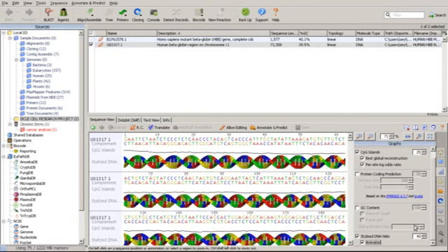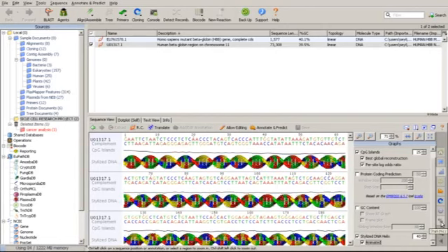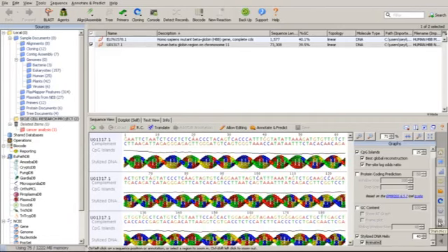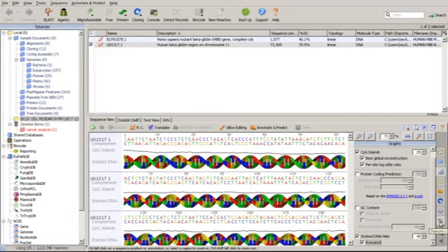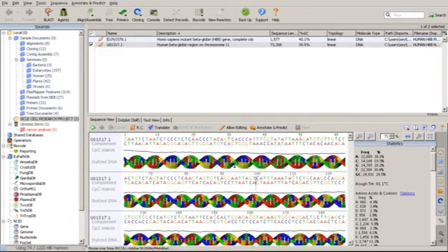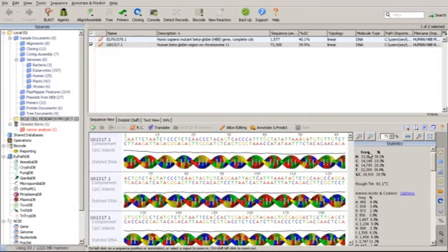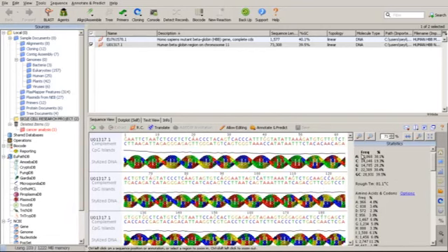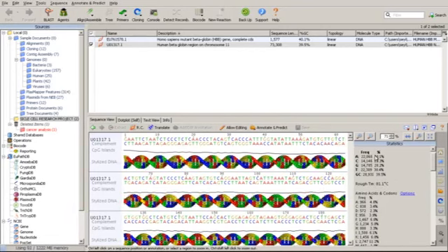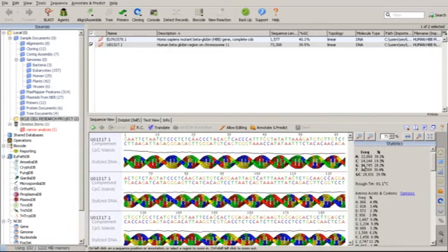Another thing we do is, let's look at the next thing, which is by clicking this icon here, as you can see. This gives us a brief summary of this particular sequence we're working on. So what you need to do is begin to understand what this data is all about, what these statistics are all about. Just listen very carefully.